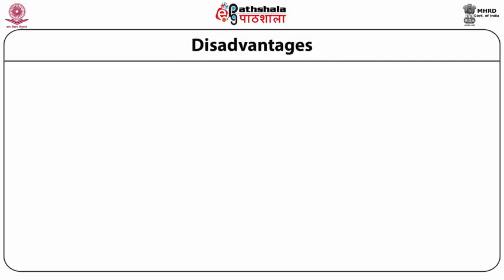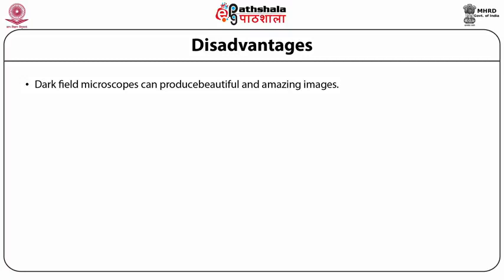Now, let us see the disadvantages of the dark field microscopy. Dark field microscopes can produce beautiful and amazing images. However, this technique also has some limitations.